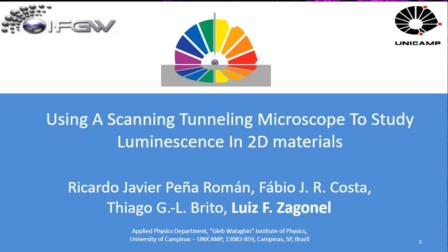I'd like to begin by mentioning that the morphological and electronic properties that we will be interested in will be studied by scanning tunneling microscope. But it's a very versatile tool, so I'll start by describing a little bit about it. And the optical properties that are interesting for us are the luminescence properties of these 2D materials that we are going to explore in this presentation.